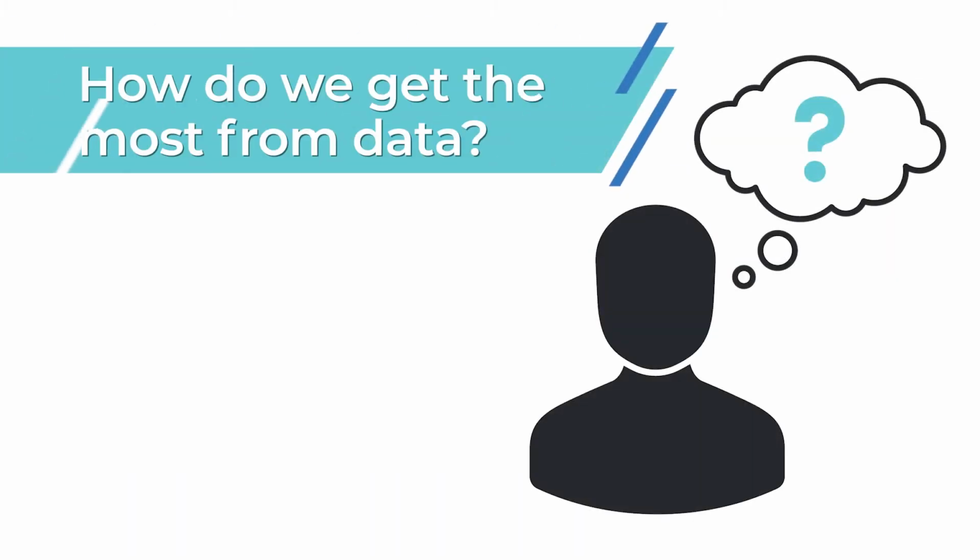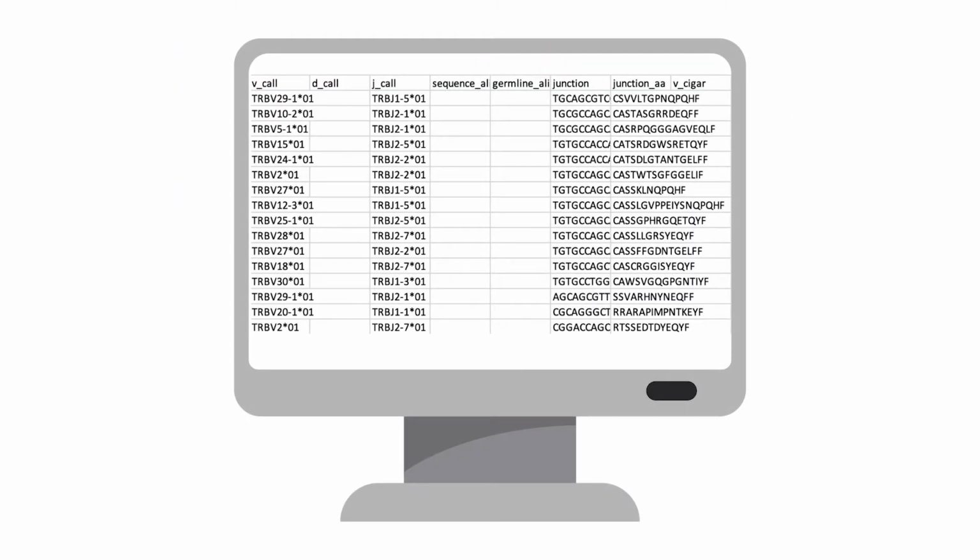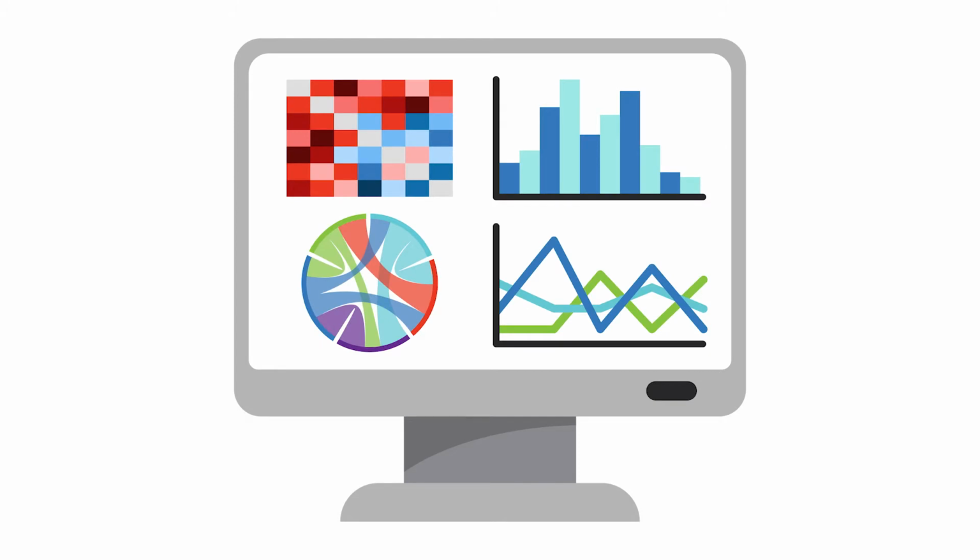How do we utilize the TCR repertoire data adequately? A static view of the TCR repertoire doesn't present the full picture about the health status. Tracking clones over time can provide insights into health and disease progression or treatment efficacy.